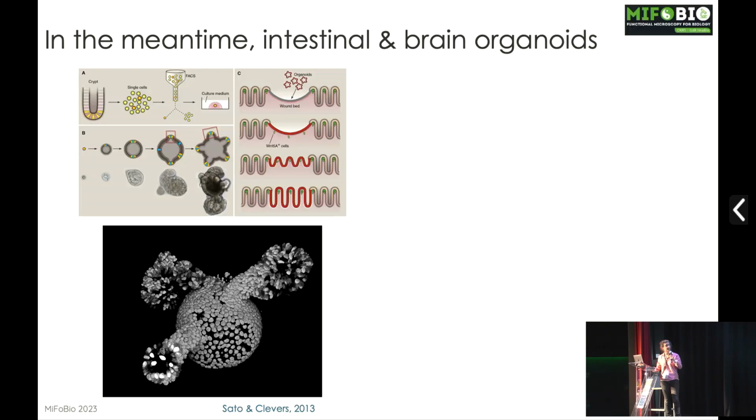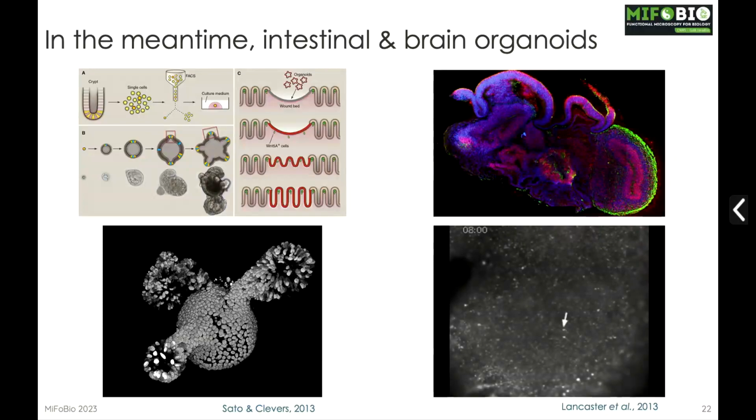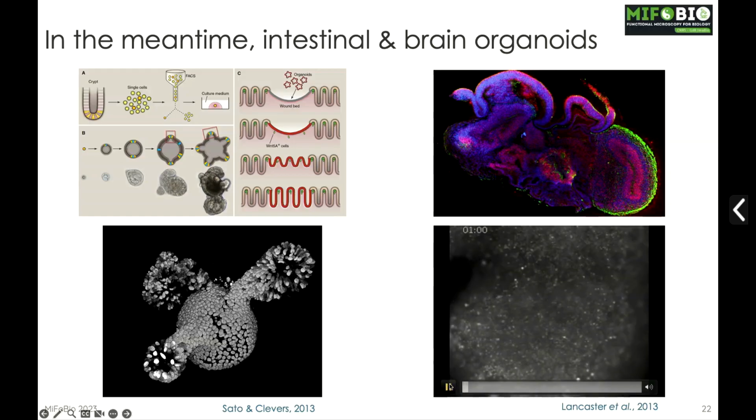And approximately at the same time, Madeline Lancaster, in the group of Juergen Knoblich, was making those amazing mini brains. Of course, a beautiful picture like that is not completely the reflection of all the organoids that they have in their dishes, but in this one, you can guess that you have the cerebellum, the telencephalon, and all the layers that you can find in the brain. And they were even able to record live some spontaneous calcium activities within them.